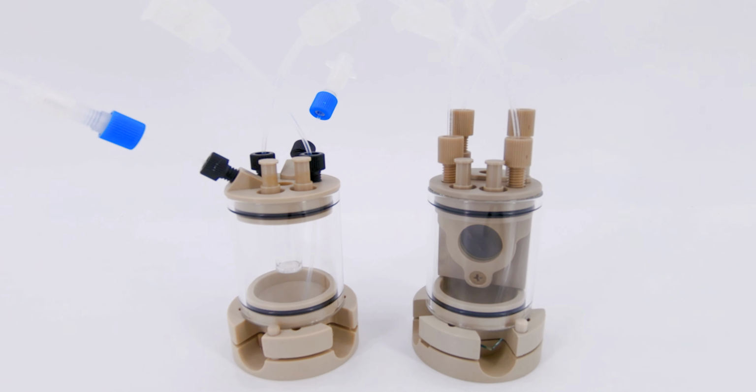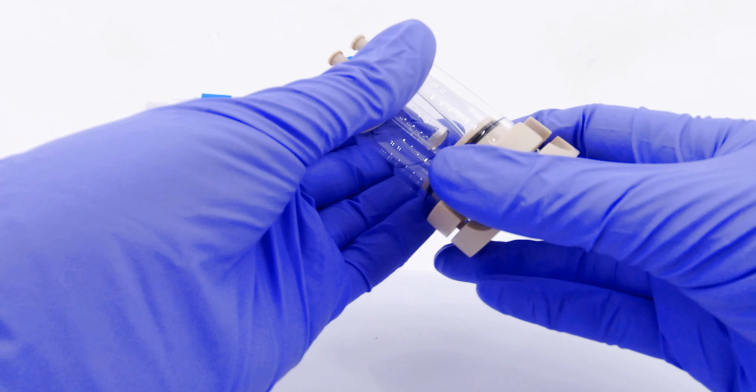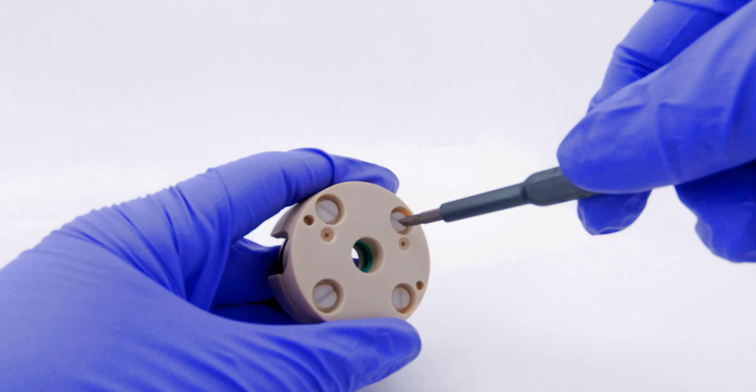Today we're diving into the assembly of two closely related electrochemical cells, the bottom-mounted two-compartment cell and the bottom-mounted H cell. Starting with the working electrode mounting process, which is identical for both cells, begin by twisting off the glass chamber and placing it to the side.